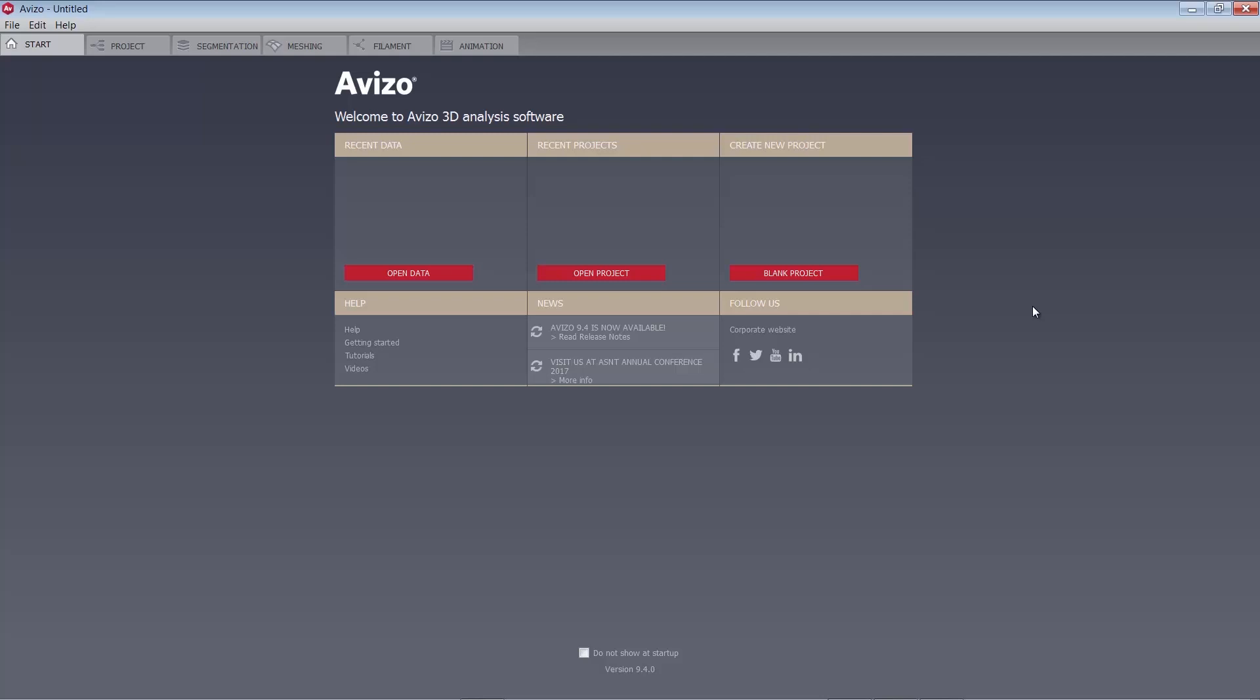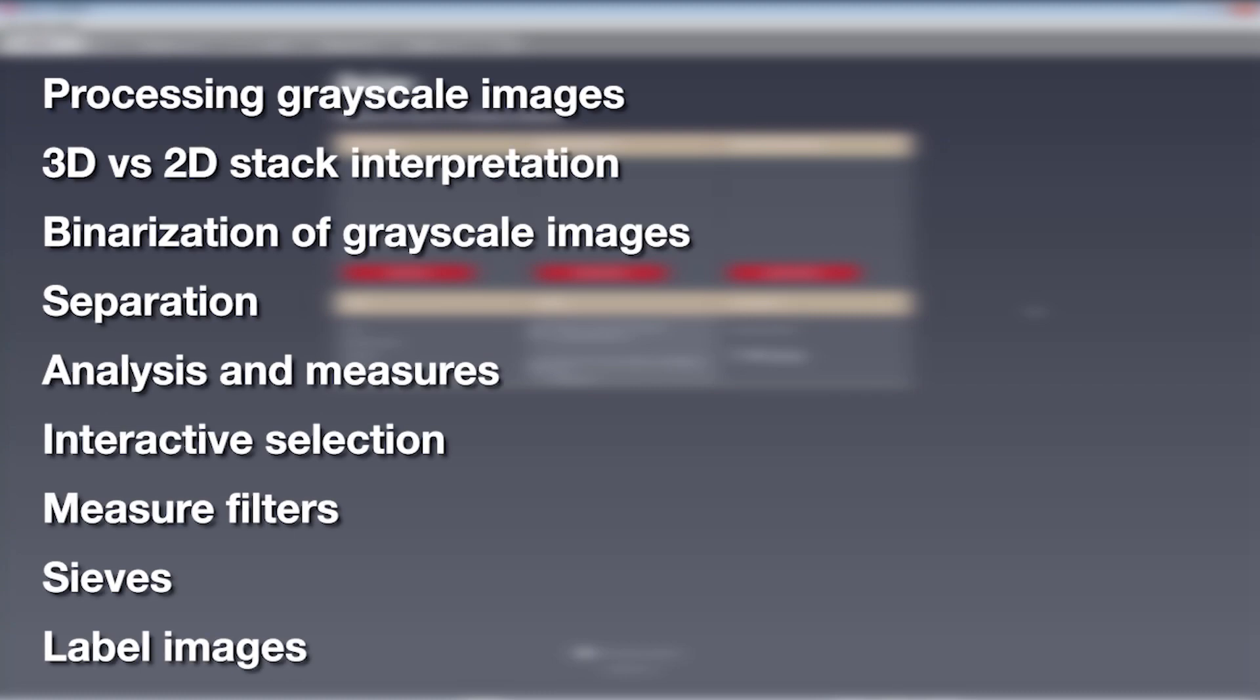This tutorial has the following parts in order: processing grayscale images, 3D vs 2D stack interpretation, binarization of grayscale images, separation, analysis and measures, interactive selection, measure filters, sieves, and label images.